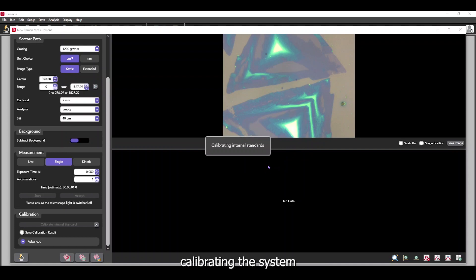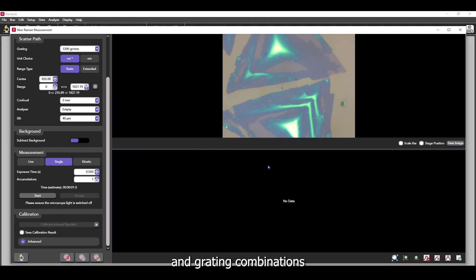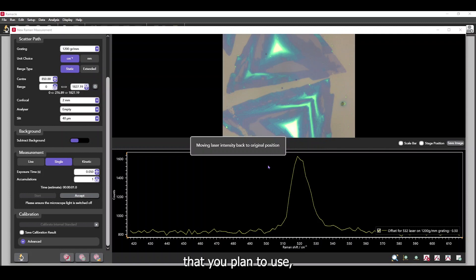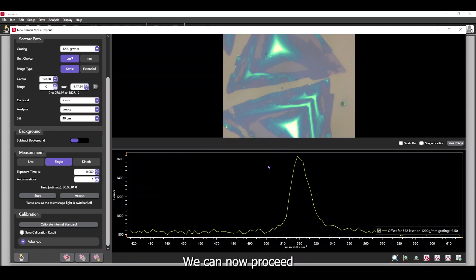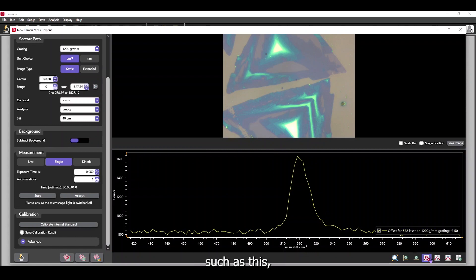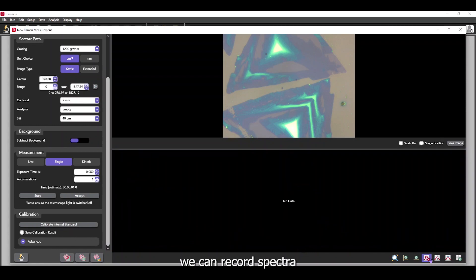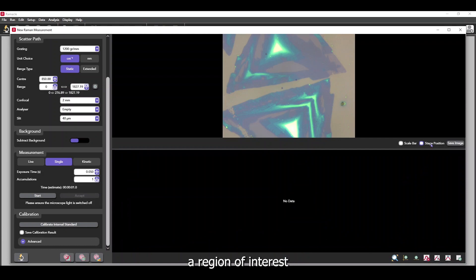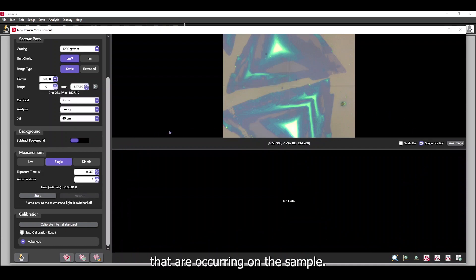We recommend calibrating the system after turning it on for any laser and grating combinations that you plan to use, like we've just done. We can now proceed with taking a measurement. For a sample such as this, we can record spectra from both on and off a region of interest to gauge any changes that are occurring on the sample.